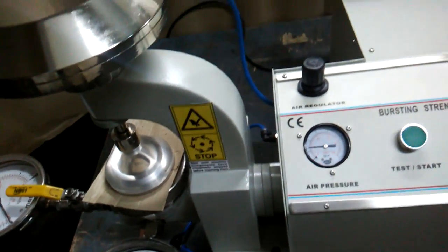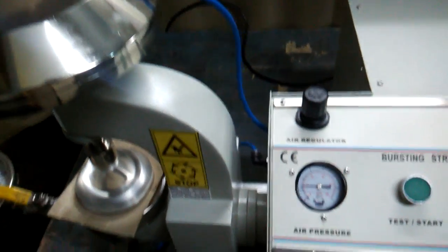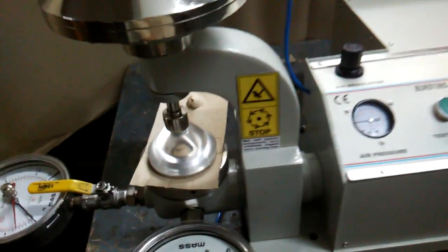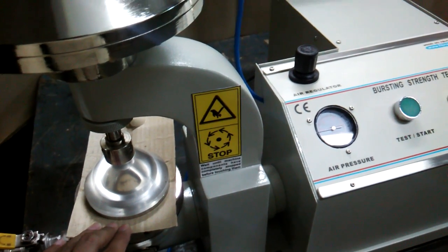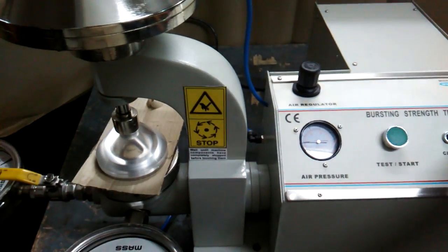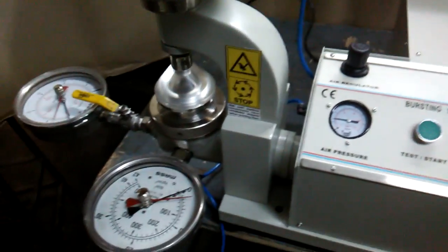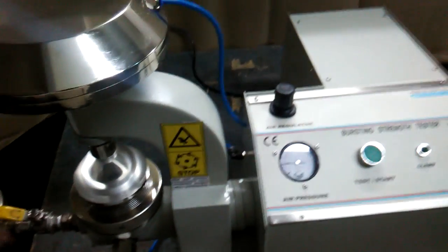Similarly, we can check the higher strength of the boxes or cartons. You have to take precautions — no hand should be inserted while it is operating, because it can give you injury. We are going to prepare a new specimen so that we can show you the higher pressure ranges.